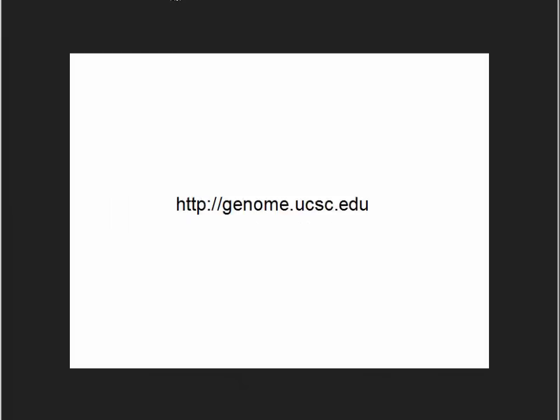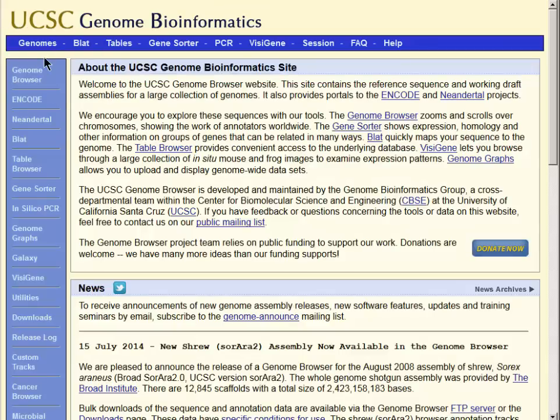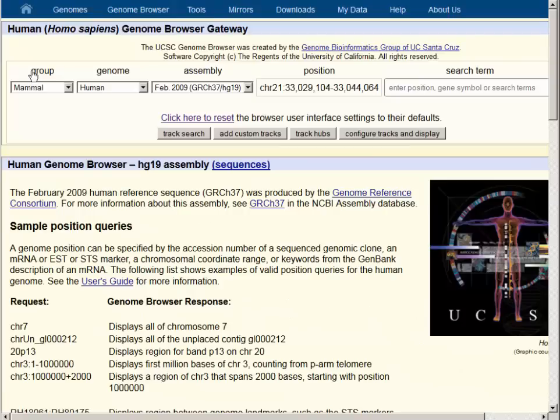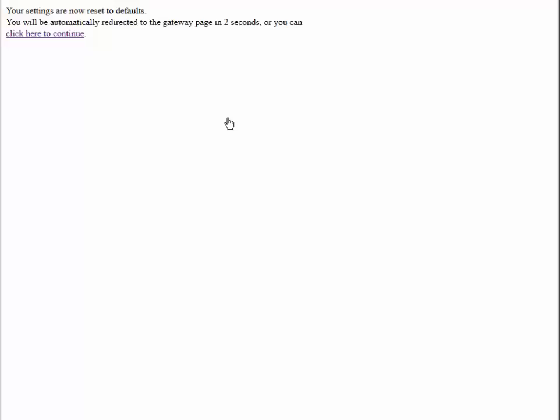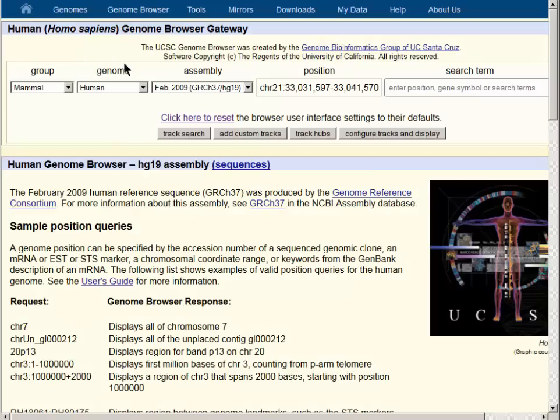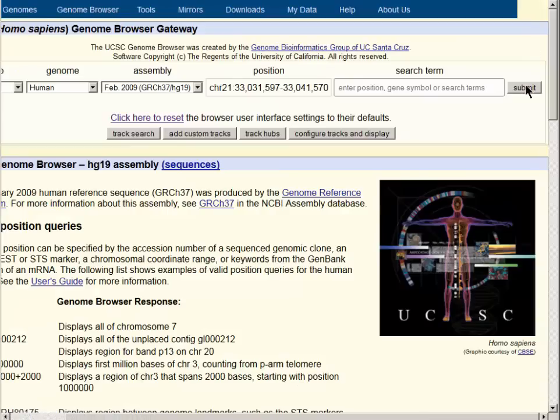To start we will go to the genome browser at genome.ucsc.edu. In the upper left hand corner are two links that take us to the main page of the browser where we can choose which organism to use. We will use the human default assembly hg19. The click here to reset button takes us to the default location and the submit button will take us to the browser graphical viewer.